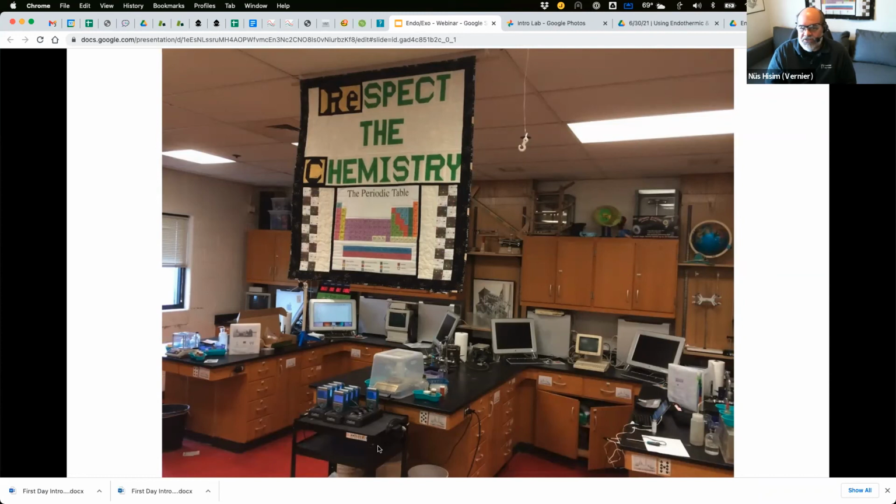But yes, you can do this activity with the brand new stuff. If you do, my suggestion would be on day one, you plug it in with the USB cable that it comes with, if you can, just to make life easier. If your students are using a device that doesn't have USB, you may need to connect the sensors for them before class. Was there a question?